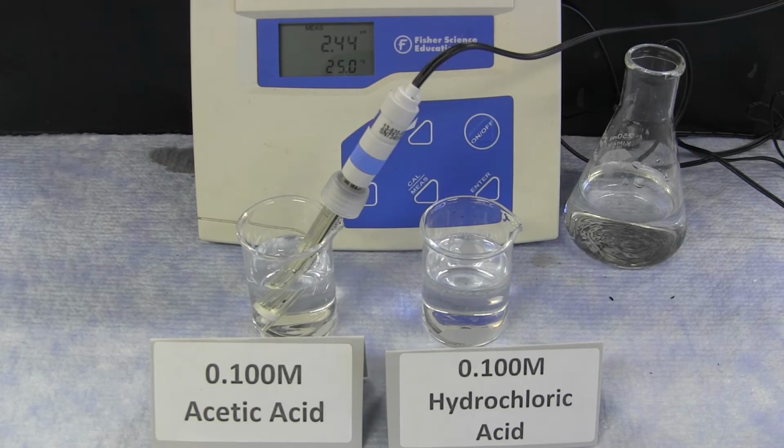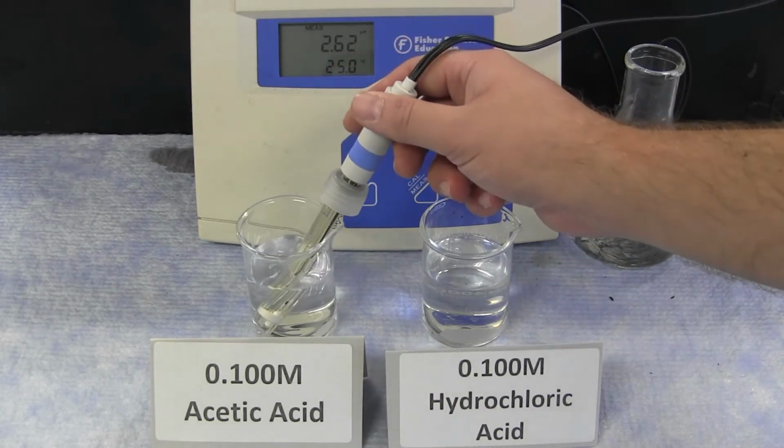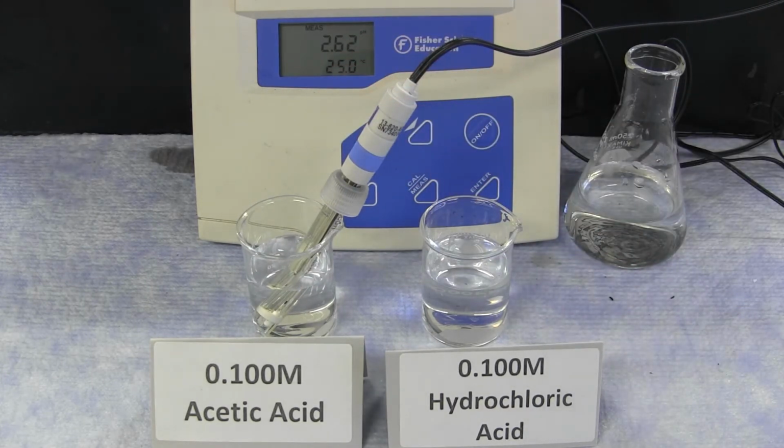Therefore, there will be less of a concentration of H+ than the original solution. Based on the measurement of pH, you can determine the exact concentration of acid present in the acetic acid sample. And then dividing that by 0.100, you can obtain the percent ionization that occurs for acetic acid.